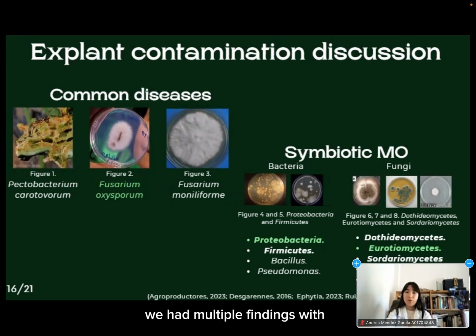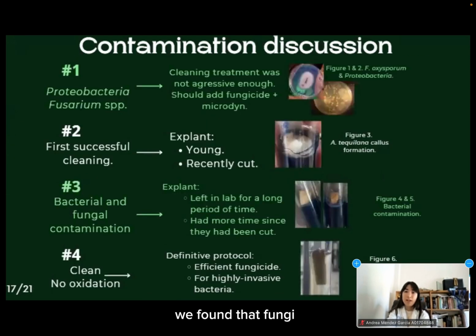We had multiple findings with each protocol. For the first one, we found that fungi and bacteria were resistant enough to bleach and alcohol, so specific fungi and bacteria killers were added. By using them, we had better results, but still got contamination.